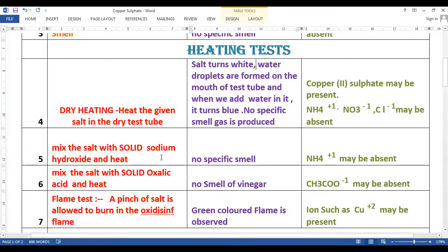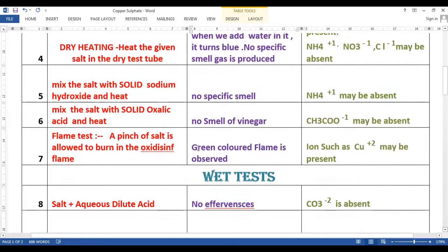When we mix the salt with solid sodium hydroxide and heat it, there is no specific smell, so we can assume that NH₄⁺ ion may be absent. When we mix the salt with solid oxalic acid and heat it, we do not get any smell of vinegar, and that is how we can conclude that CH₃COO⁻ acetate ion may be absent.